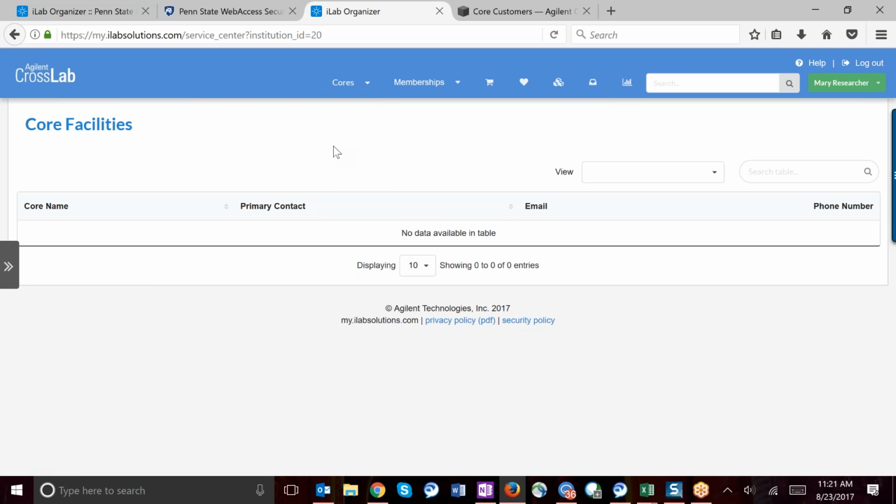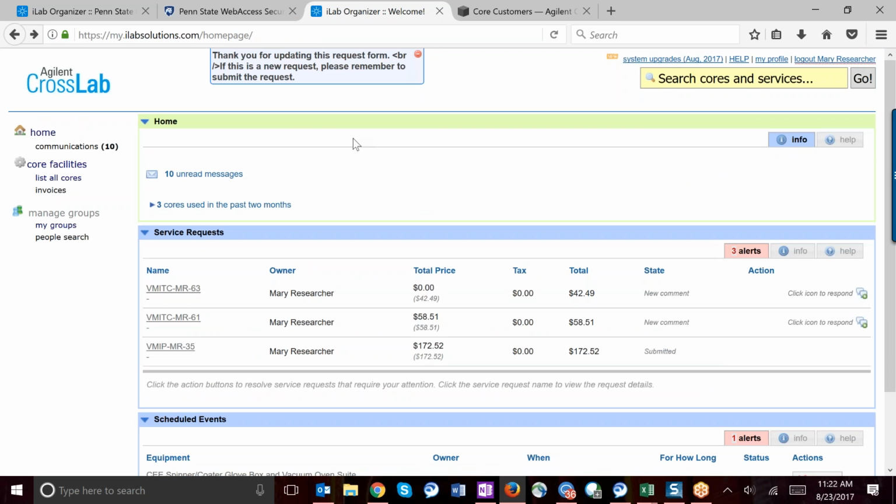Any questions? That's really, I think, from the customer perspective, pretty much the bulk of what you need to know. Are there any questions, or did you want to see a portion of it again? I have a question. Sure.